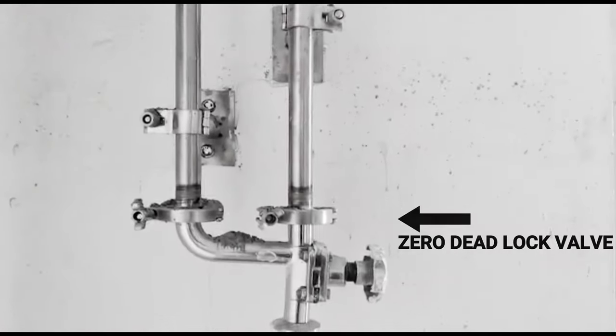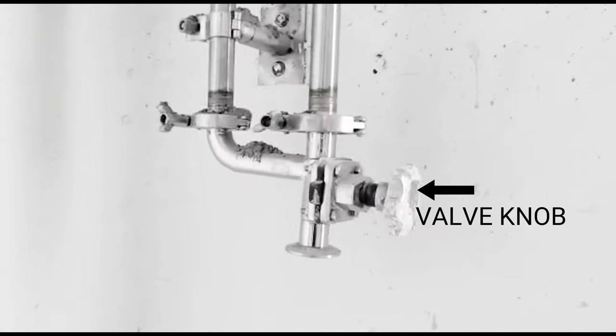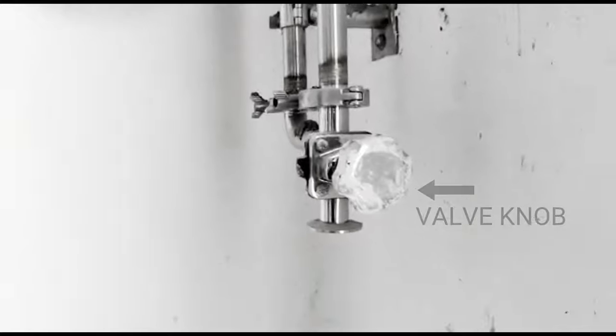These pipes are connected to a zero deadlock valve. Here the valve has a knob through which we can open or close the water supply to the machinery through the underside of the valve.